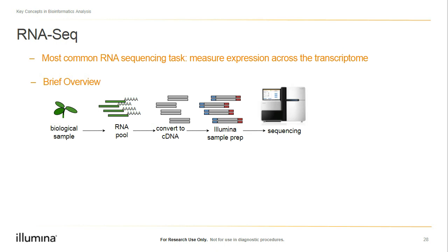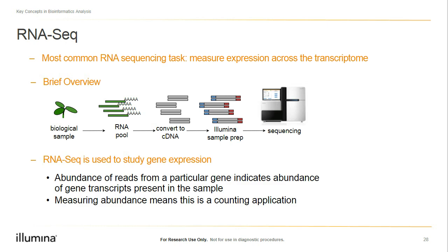In this most common case, we are looking to find gene expression. This equates to how abundant a particular gene is as opposed to another for a particular sample. The sample could be the same sample at different time points after a treatment. And in that case, we would take a plant at time 0, add a chemical or the treatment, and measure what genes are expressed half an hour, or even 2 hours after the treatment. Basically, in this case, we are counting what genes are expressed or not expressed over time for that plant sample after we've added our chemical or other treatment.